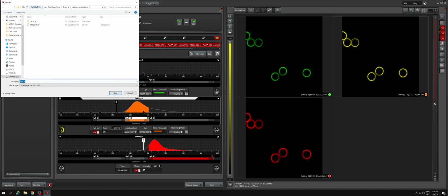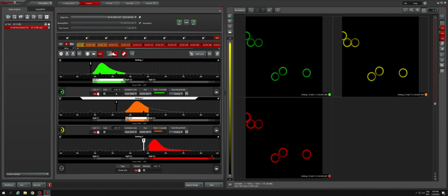And then it's going to come up here and you have to pick the right file. So it should be on the E drive always. And then you want to go to the file that says user data goes here. And then you can set up your own file. And so I've got my file here. Just pick that and test is fine. And it's actually going to save it as a Leica file, which you can open in Fiji or ImageJ, and there's that kind of analysis software. And that's just it.